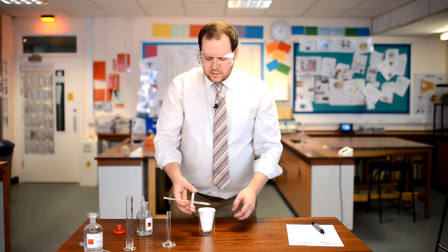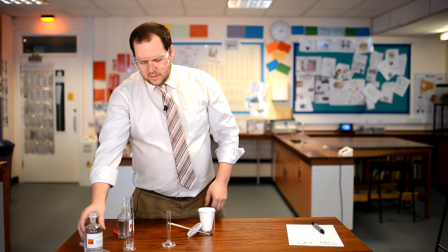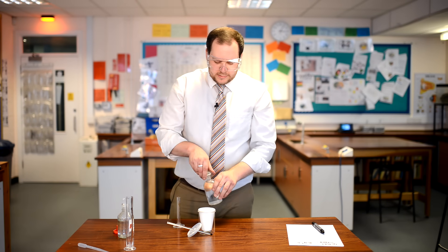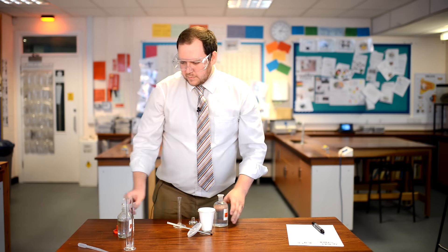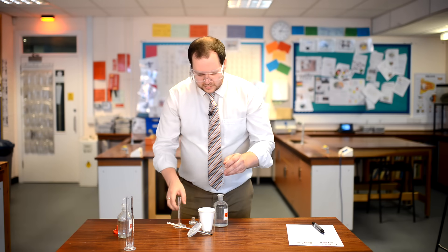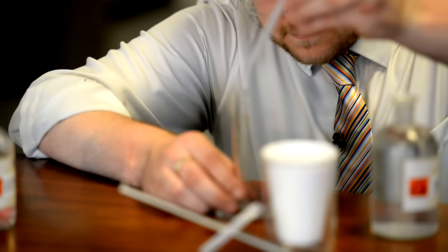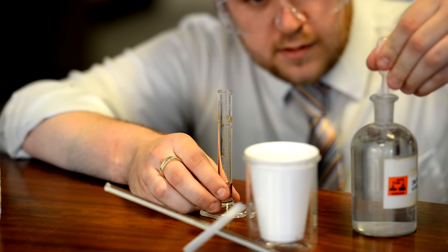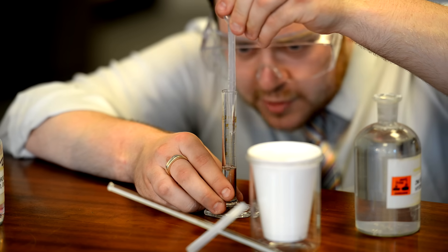Take the lid off and using the 10 centimetres cubed measuring cylinder, measure 5 centimetres cubed of sodium hydroxide. I'm going to measure this using the pipette only, because it's such a small quantity. Once again, measuring precisely with a pipette and reading to the bottom of the meniscus.